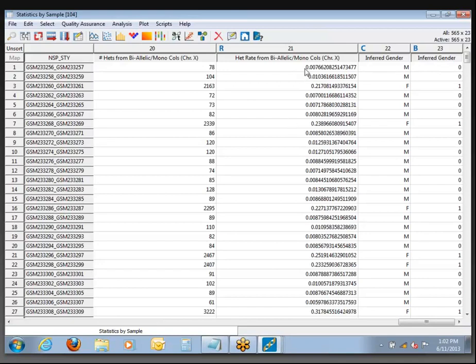The inferred gender column is based on whether or not the observed heterozygosity in the X chromosome was above or below the threshold we specified. If I want to compare this to the original phenotype spreadsheet to see whether the gender matches, what I need to do is begin by merging this output together with that original phenotype. Data merges are pretty easy and simple as long as you have the same row label column at the far left.